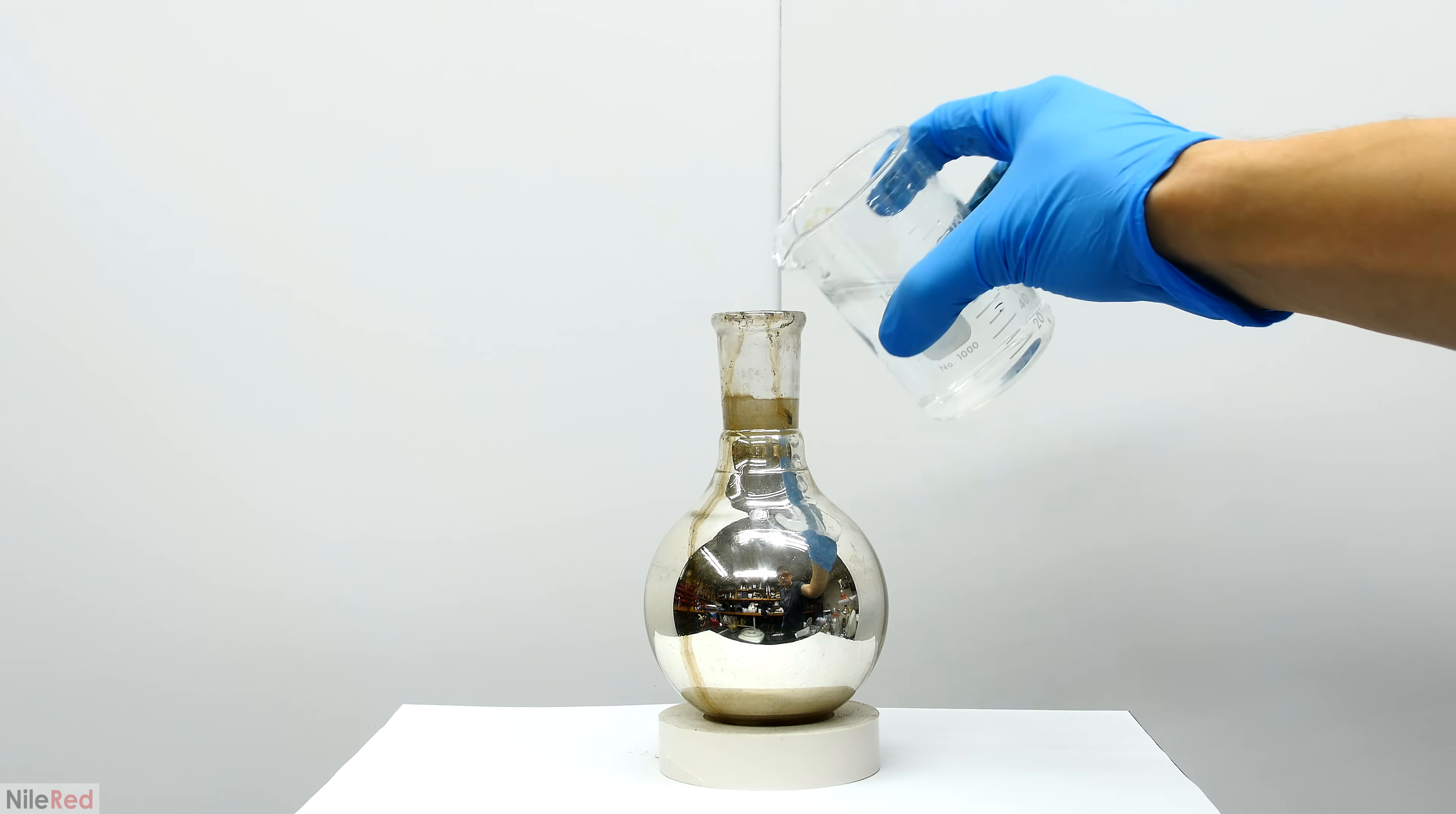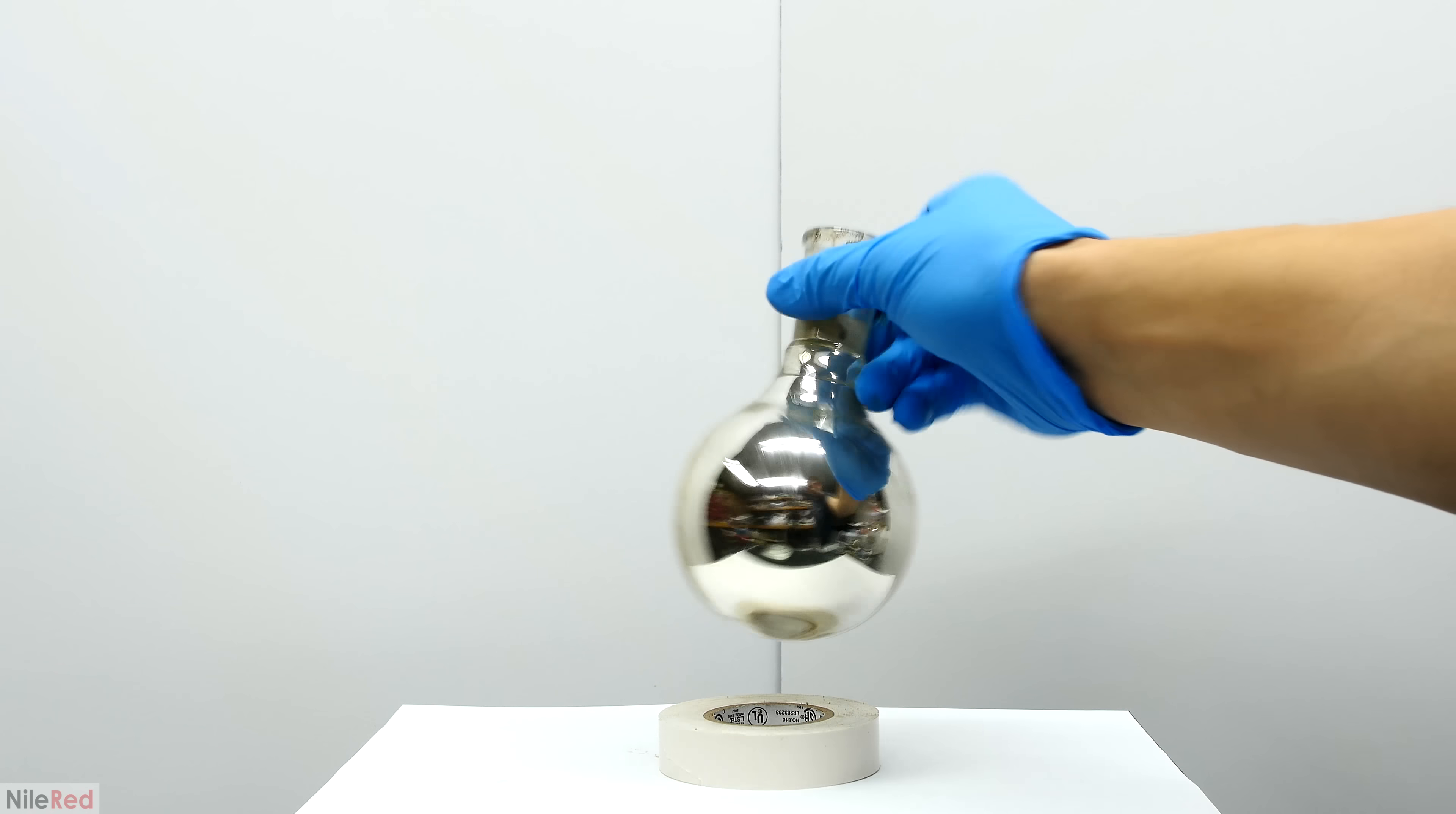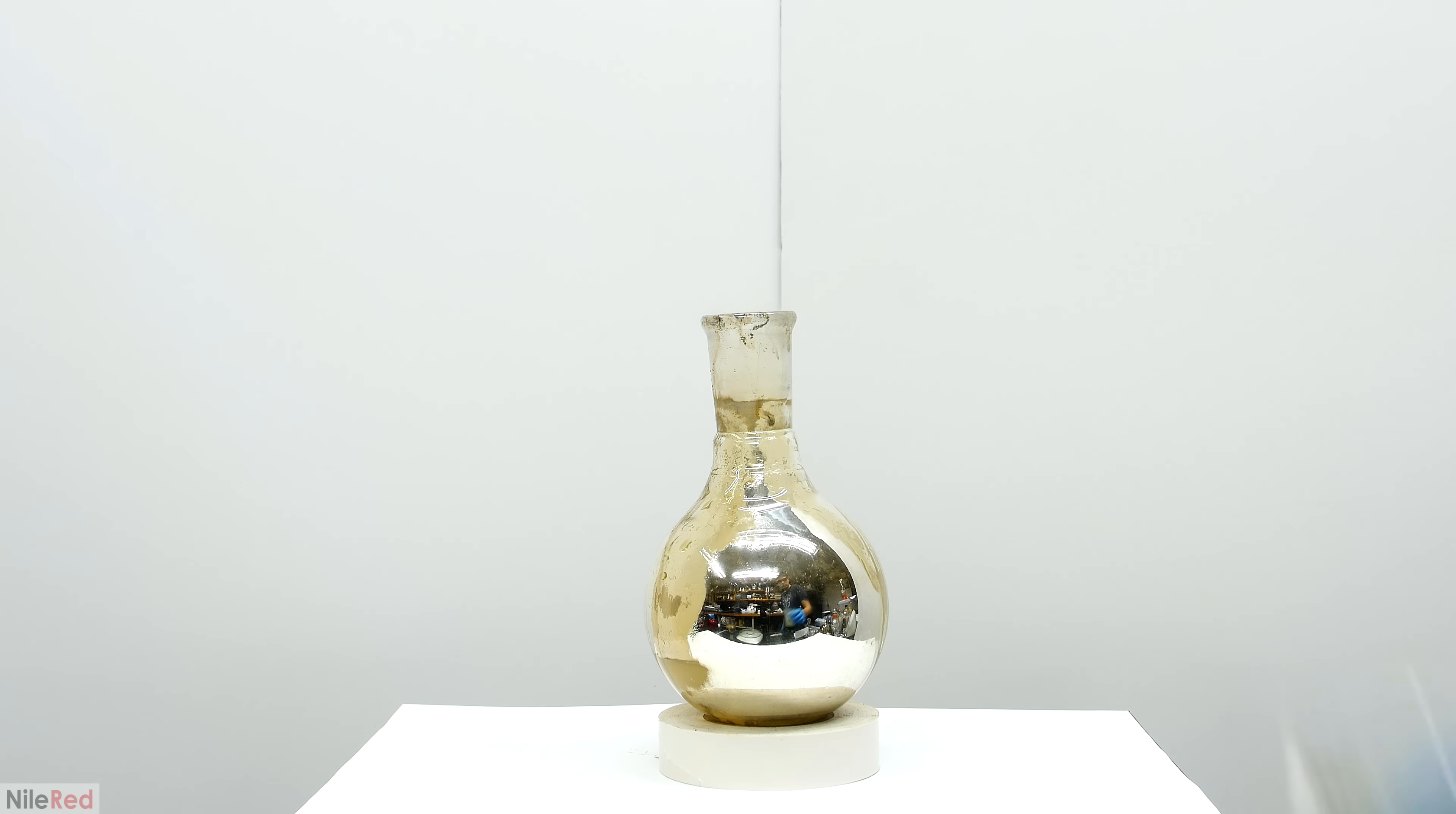Now there's the option where you can either keep the silver mirror or clean the flask. If the flask is washed and capped, the mirror should remain untarnished for a decent amount of time. I wanted to keep my flask though, so I quickly cleaned it with some concentrated nitric acid. The nitric acid reacts with the silver to form silver nitrate, which dissolves into the water.